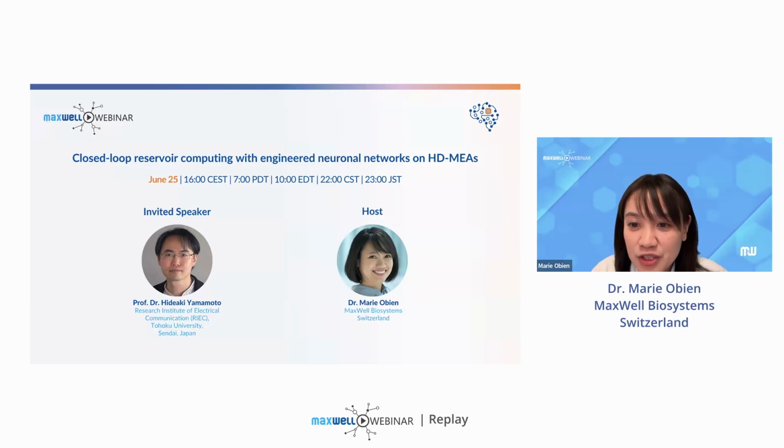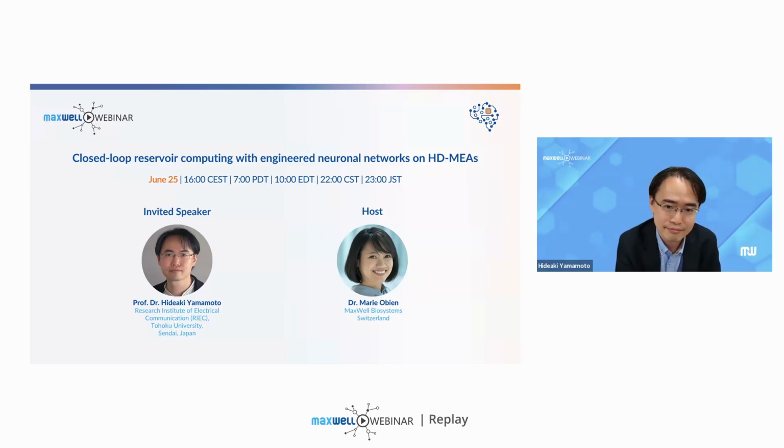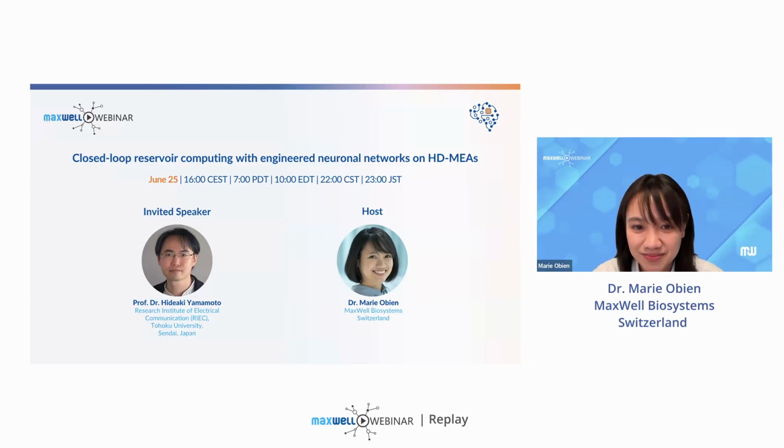Thank you. Next, we have a question from Frank. In hierarchical modular networks, are the connections between the squares directional, or can neurites grow bidirectional? We are working on making asymmetric connections, but that was in a different project. For this particular project, we're always using symmetric connections. So they're bidirectional.